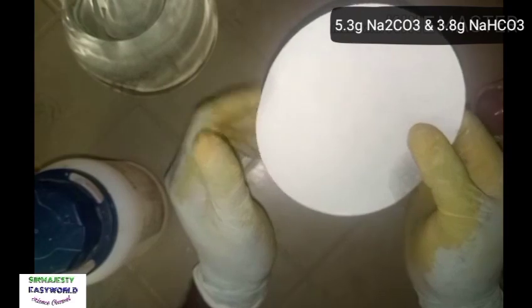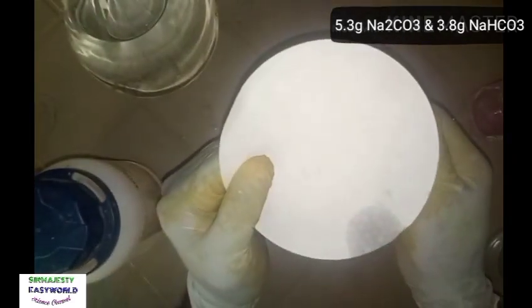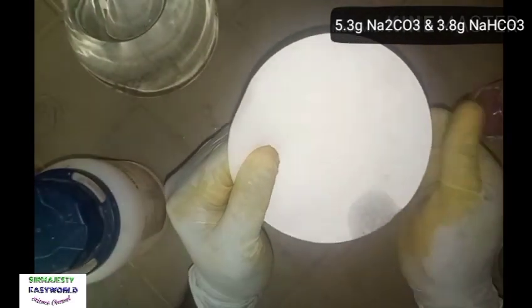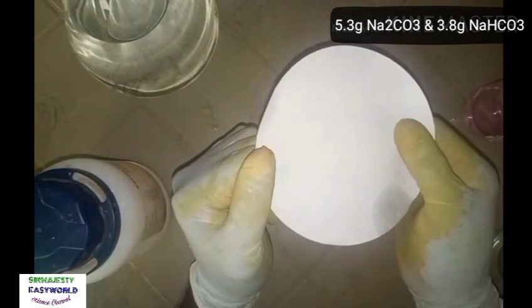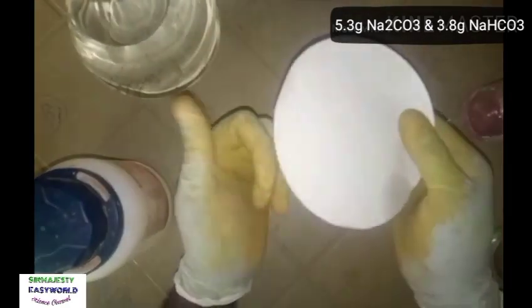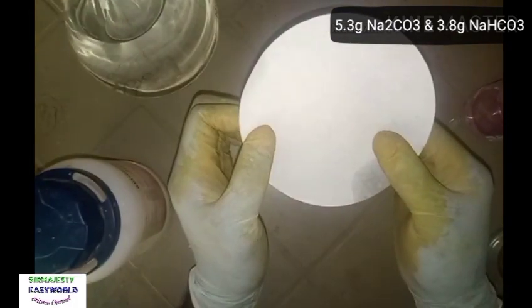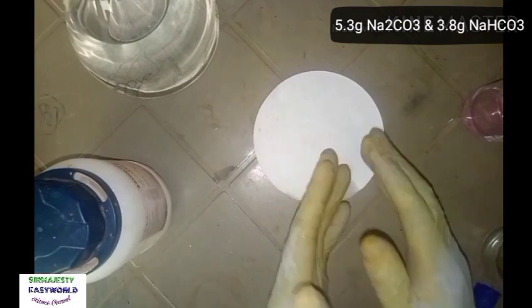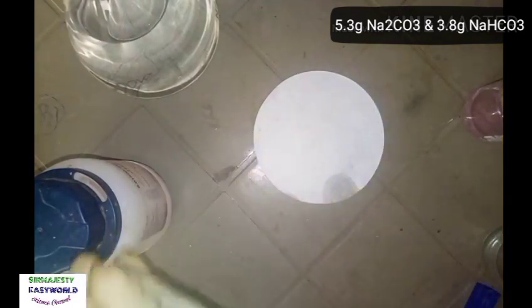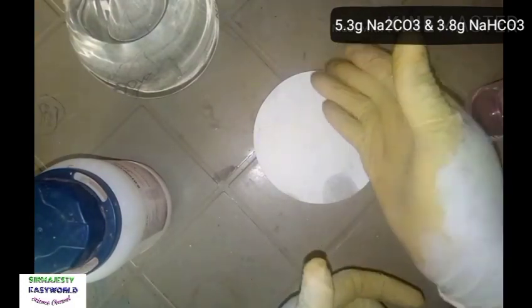Here, first of all, you need to know the weight of the filter paper if you're using filter paper, but I advise you use filter paper to weigh. Anything you are going to use to weigh, if you want to use a watch glass, you must know its weight. This filter paper from my own weighed 1.1. So what you will do first is, remember they told you that 5.3 grams and 3.8 grams of the sodium carbonate and the sodium hydrogen carbonate respectively will be in 1 dm cube of solution.